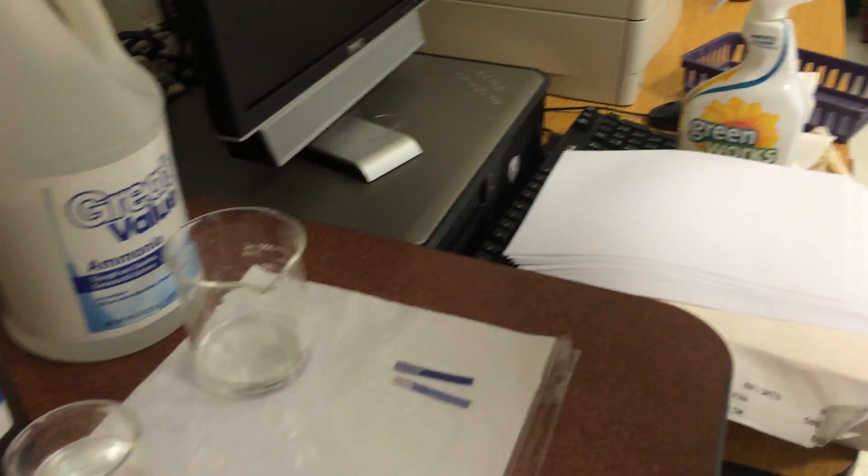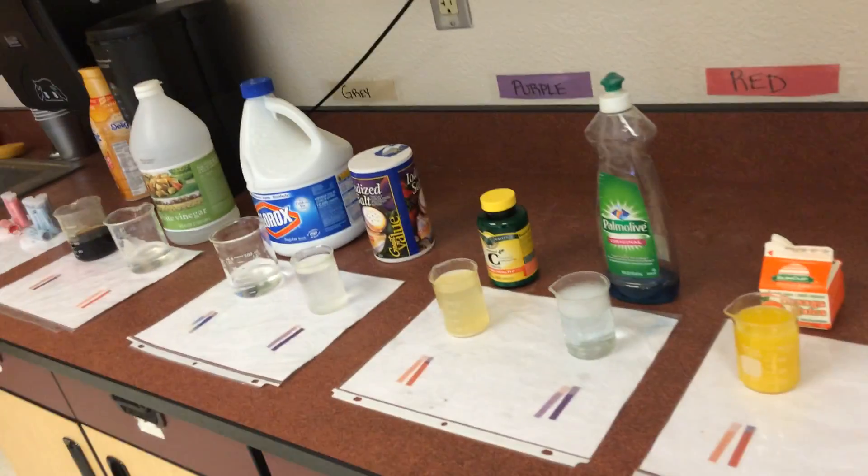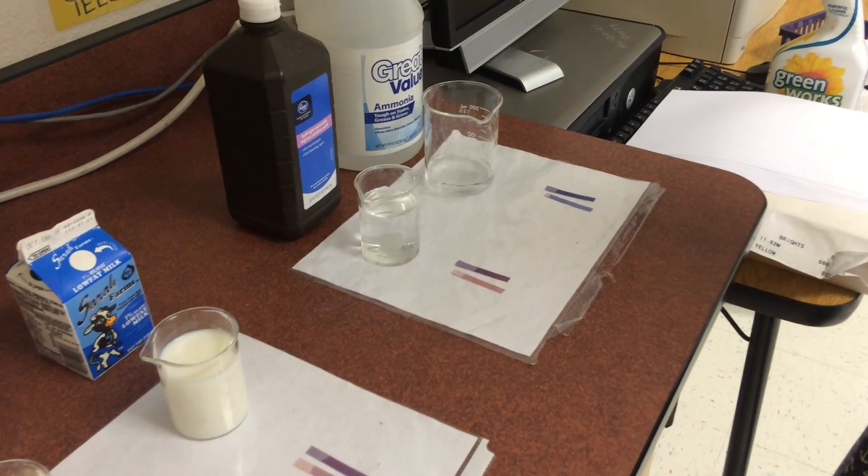So now you guys have seen about a dozen or so litmus paper reactions, and you should be able to very easily understand the difference between acids and bases with litmus paper.